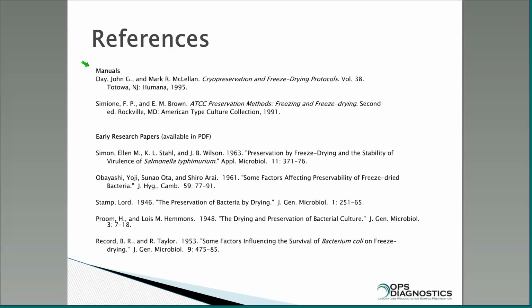This is a Russian, as far as I know. And we can discuss any of that. Is it minus 20? Why not minus 80? Well, you can freeze at minus 80.